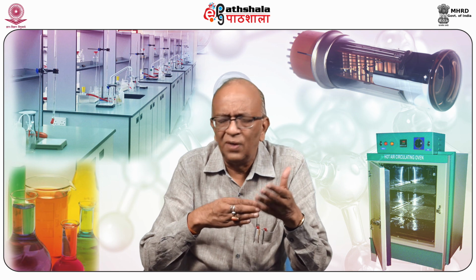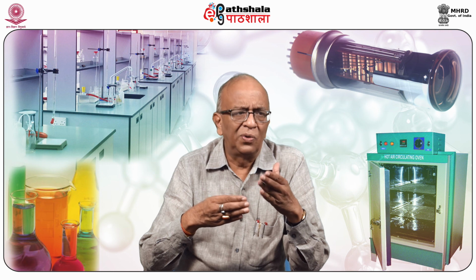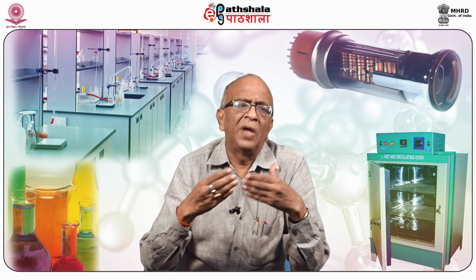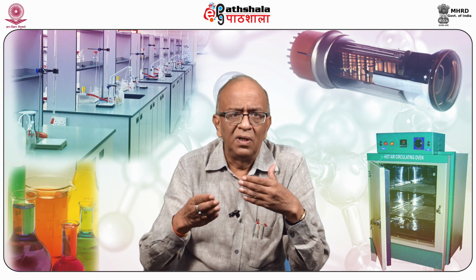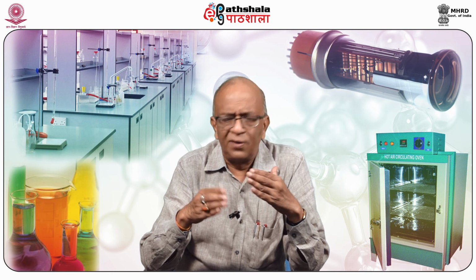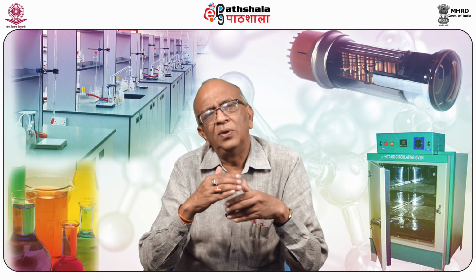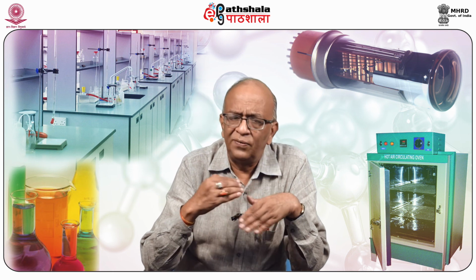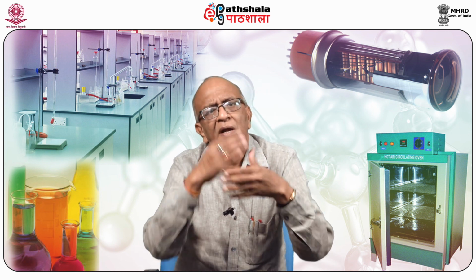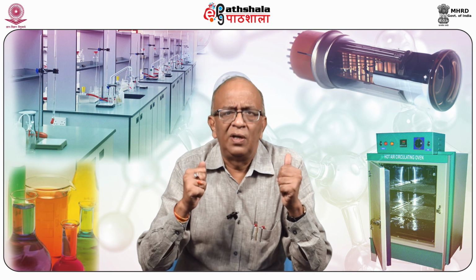For organic substances, you may put the developed chromatogram of paper or thin layer in a chamber containing iodine, or you can apply ultraviolet radiation, and it may fluoresce as a violet color. So by using different types of visualization techniques, colorless substances can also be separated by paper chromatography as well as by thin layer chromatography.